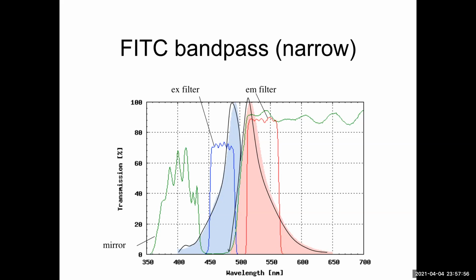So you already know what the fluorophore is. And if you'll notice, the x-axis, the bottom there, is nanometers for both of these charts. This is again two charts on top of each other. Just like when we were looking at the histogram and the lookup table, it's actually two charts right on top of each other, because it's way more useful to put them on top of each other than to have them separate and try to guess, does that align? Just the way our eyes and brains work, let's just put them on top of each other.